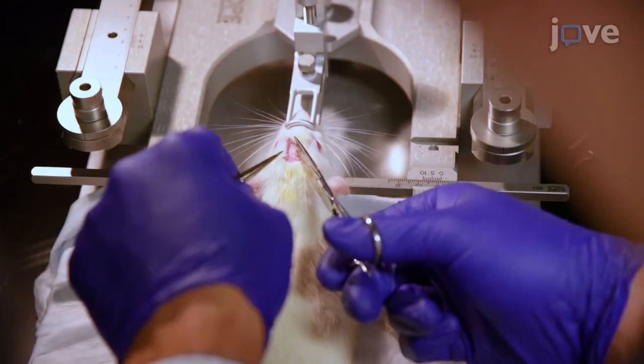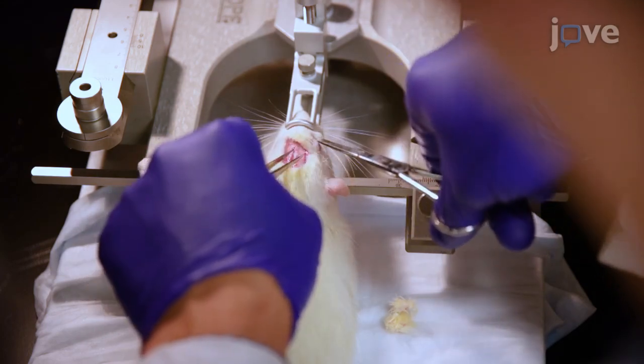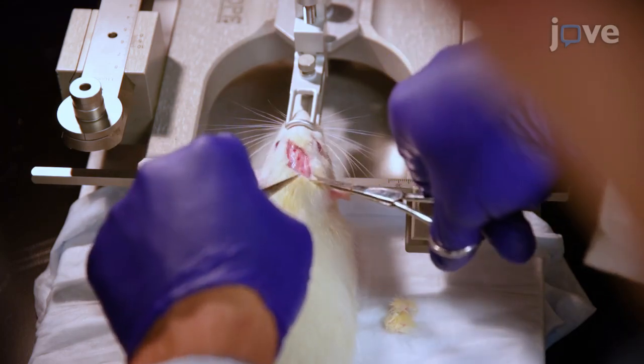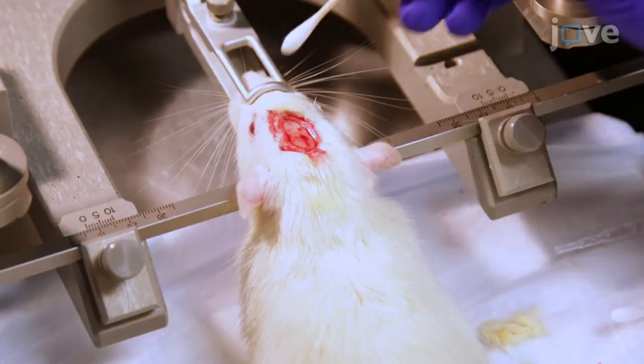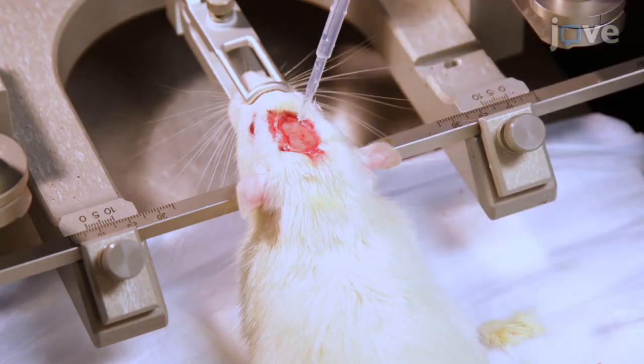After the last scrub, use sterilized needle nose tweezers and surgical scissors to cut away enough scalp tissue to make room for the implanted electrodes. Gently clean the exposed skull surface with sterilized cotton tip applicators before applying two to three drops of three percent hydrogen peroxide to help identify lambda and bregma.